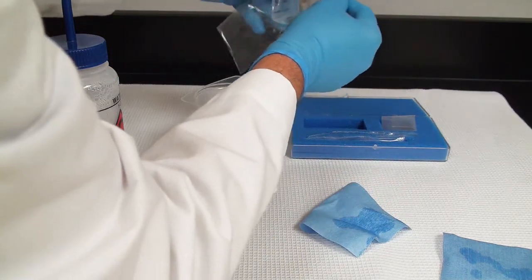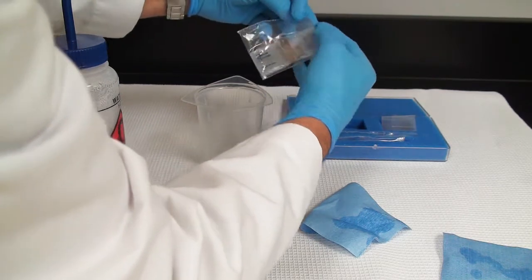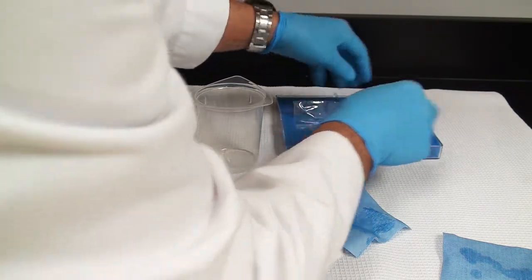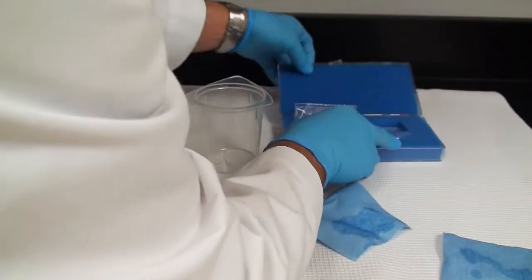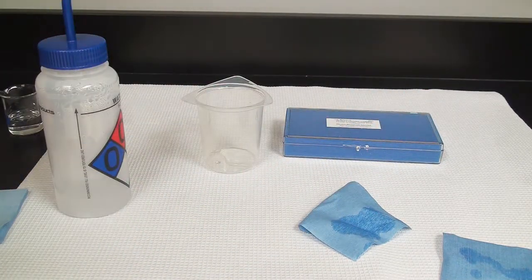Put things away — it always makes it nicer so that when you use it next time, you don't have to worry whether it was cleaned correctly. After putting everything away, I can do my calculations to determine the concentration of yeast cells per ml.